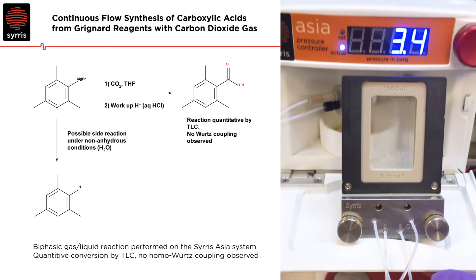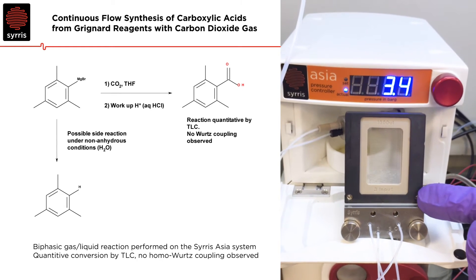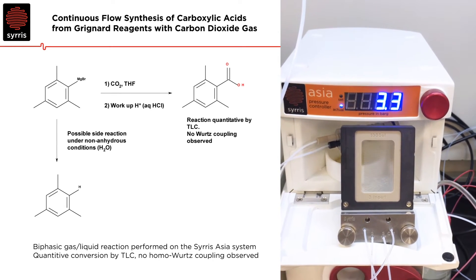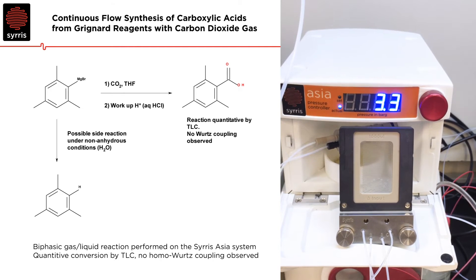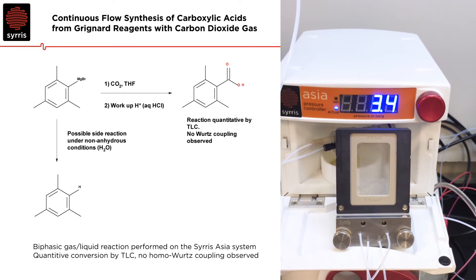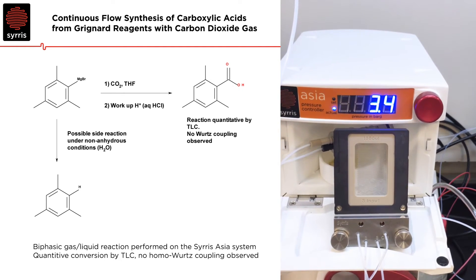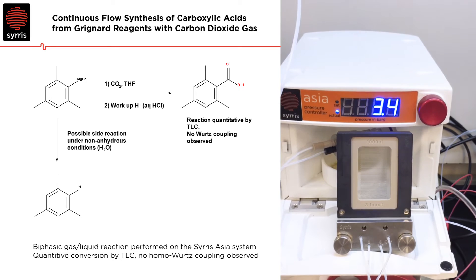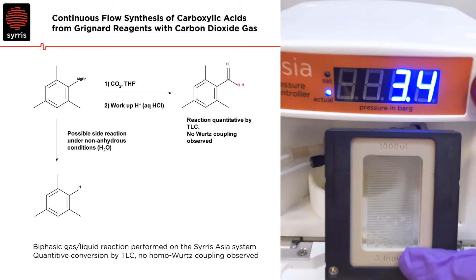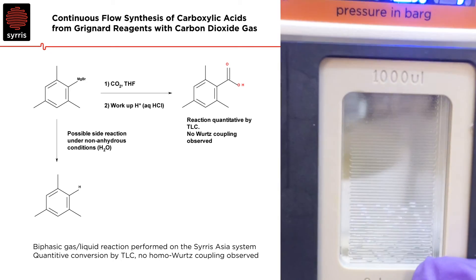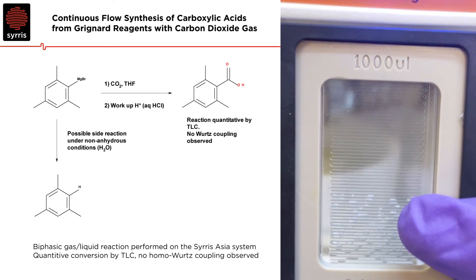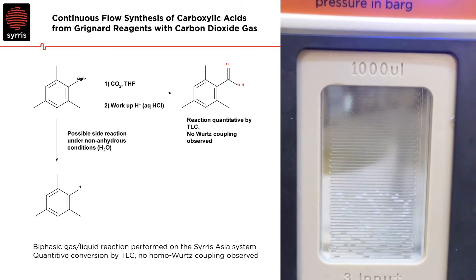Now we have a solvent line going into this reaction just to dilute our Grignard reagents to help minimise any precipitation, and you can see here we have quite nice gas-liquid partitions beginning to build up in our reactor.